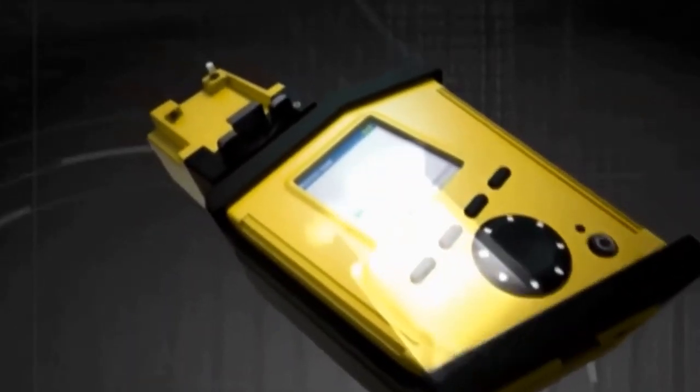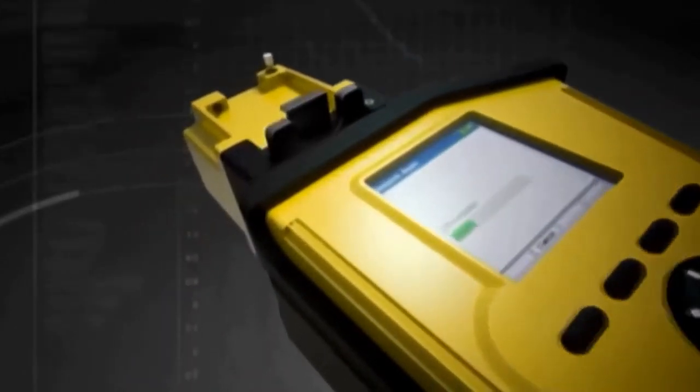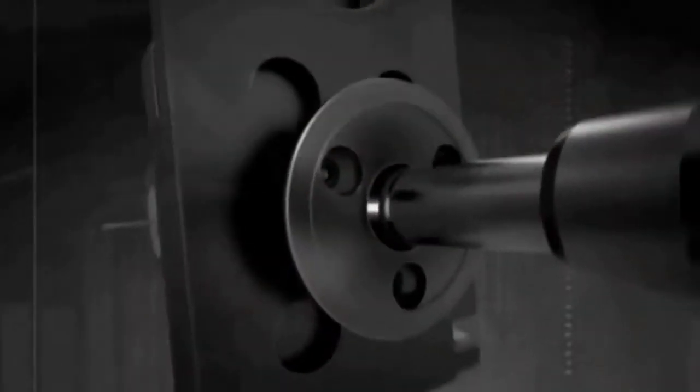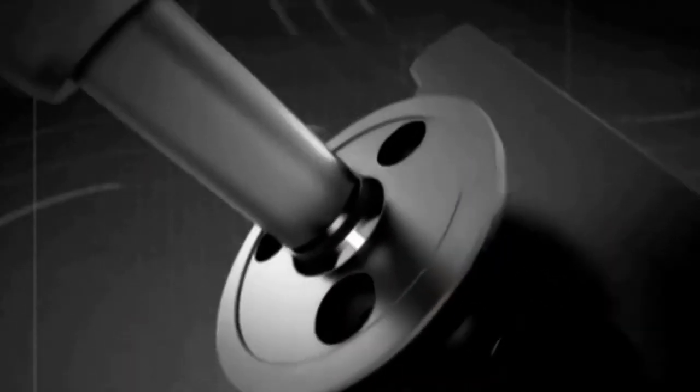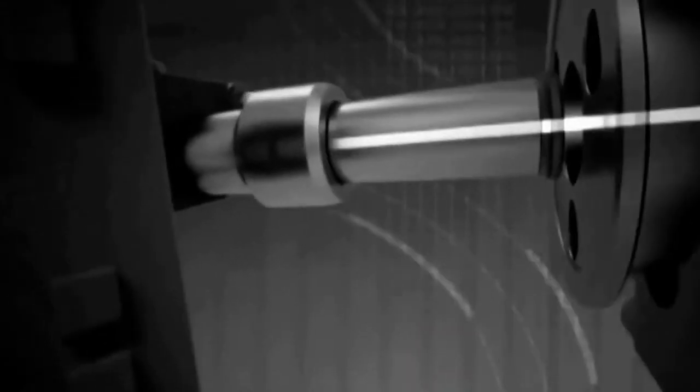When the operator initiates the analysis, infrared light beams are focused on the fluid. Light at some infrared frequencies will pass through the fluid, while at other frequencies the light will be partially or totally absorbed. The light that passes through the sample goes to the spectrometer.